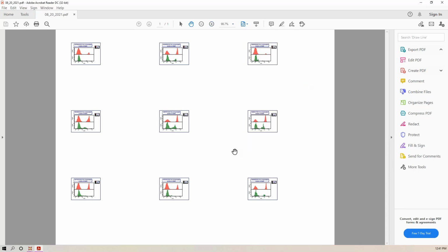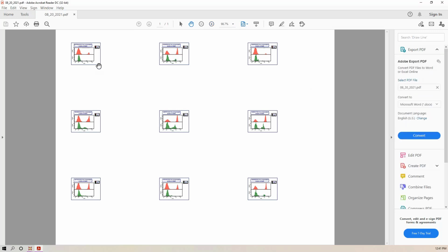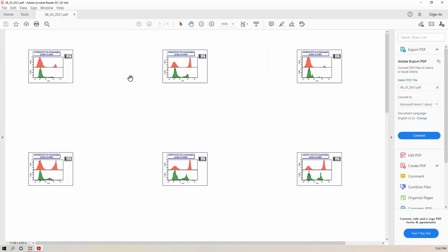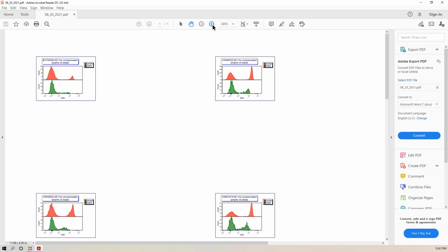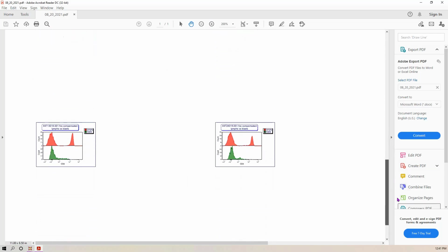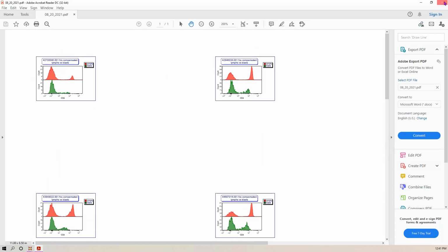And it looks like I could have made some adjustments here to make the size a little bit different, but this gives me the tiled layout of looking across each of these different plots. So I'm looking at a different iteration across each of these. As we zoom in just a little bit, you can see the different file names here, and just clicking now, I can do that side-by-side comparison. And I'll click to close that window.